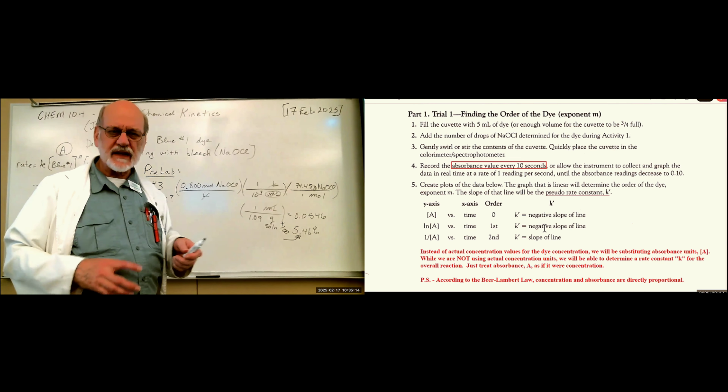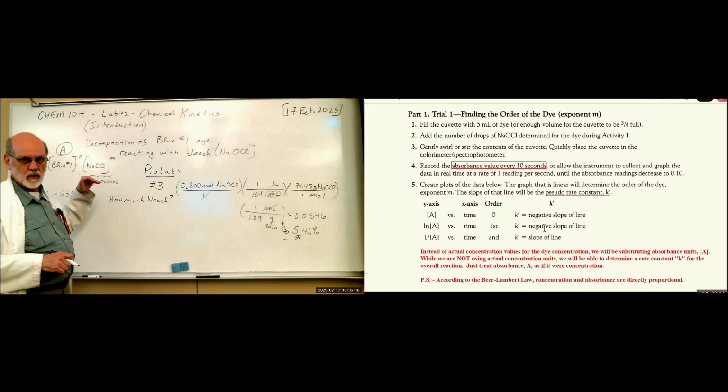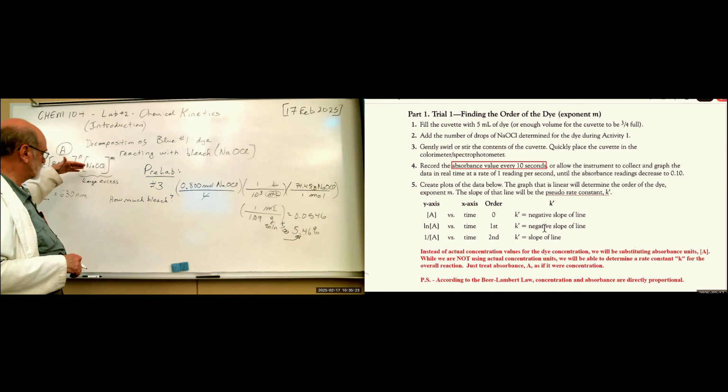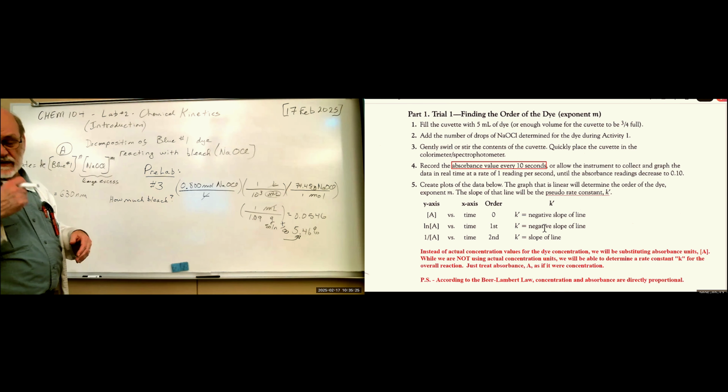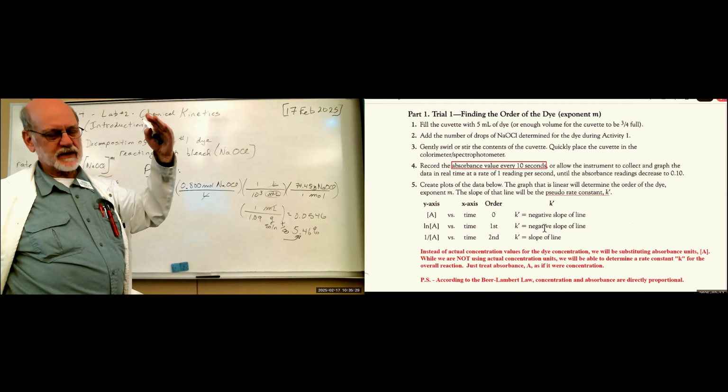Okay. Then you're going to take absorbance measurements as you go over every 10 seconds. You take an absorbance reading. So you got to be quick because you want to get those absorbance readings as close to the beginning as possible.